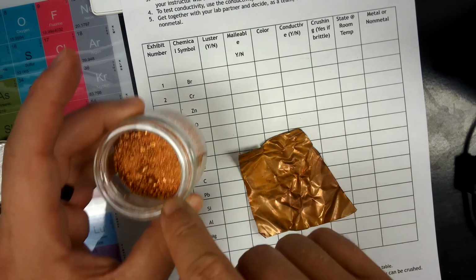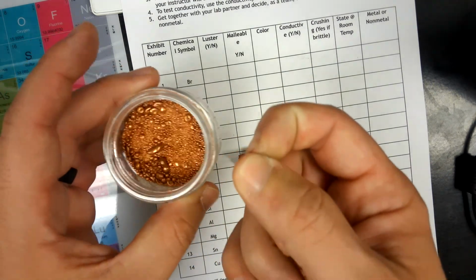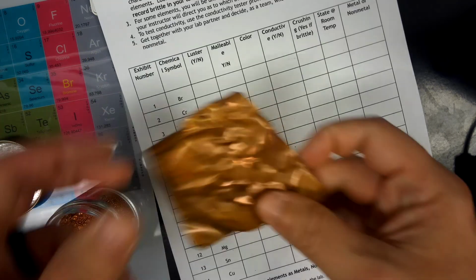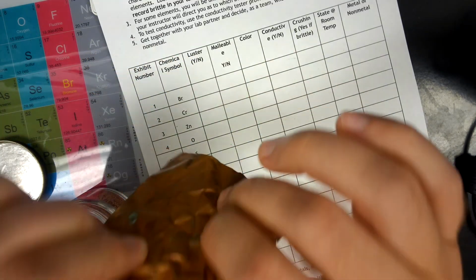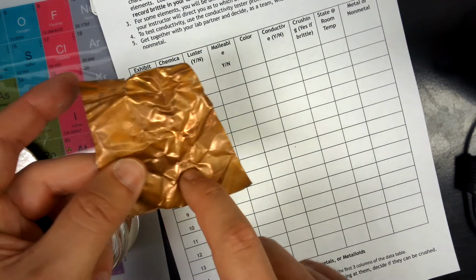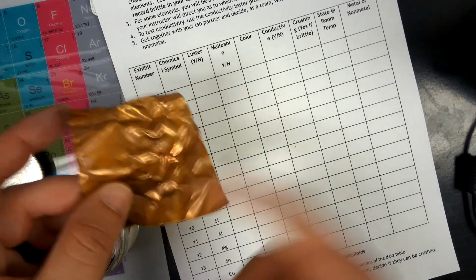The little pieces would be impossible to bend with my fingers, because just as you get to tiny pieces of things, I can't bend them. But with a big metal sheet, I can clearly see that copper is malleable. Don't use copper as the color. I'll say orange or copper colored.